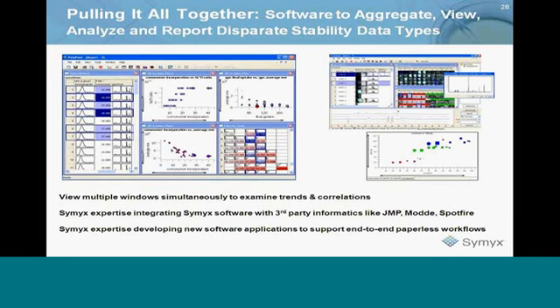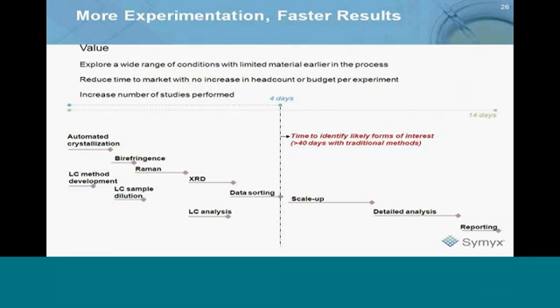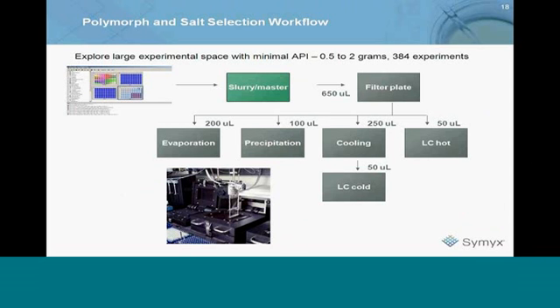Certainly. The question is, can we control the rate of evaporation here, control the formation of the desired state? Right. It's a good question. So we don't control the rate directly. What we actually do is we have two ways to do sort of an indirect way of doing things. What we typically do is it's open to ambient, and we typically do a room temperature type of evaporation. We transfer material over and let things evaporate.